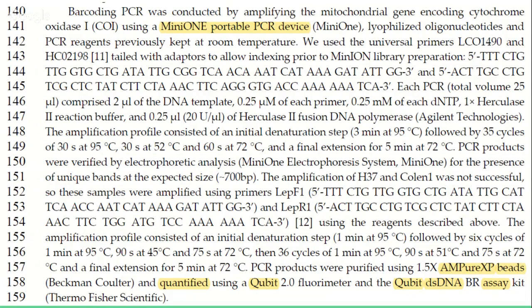And so a lot of this would not sound like rocket science to people that are used to the lab, but what's important is that they describe this system that can take place in the field. It doesn't have to be in a fancy lab to be able to do the end-to-end process.